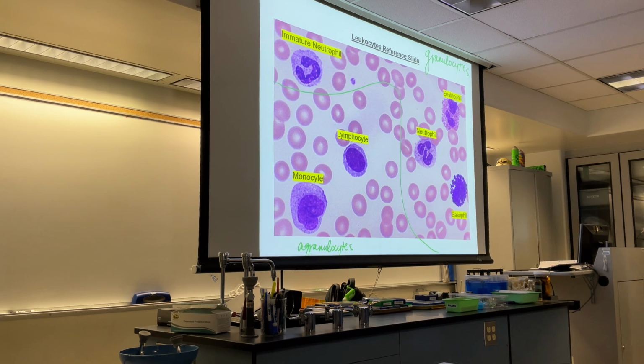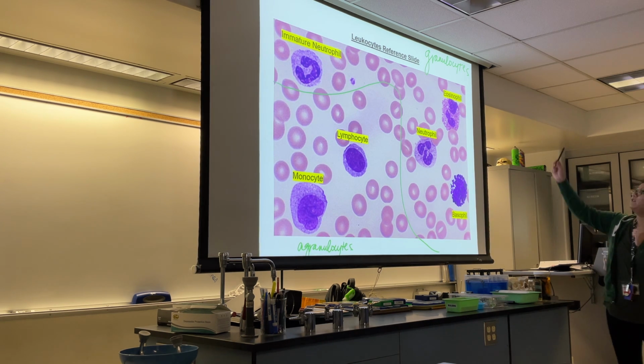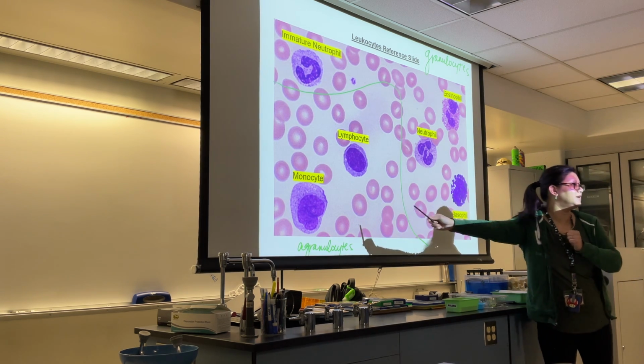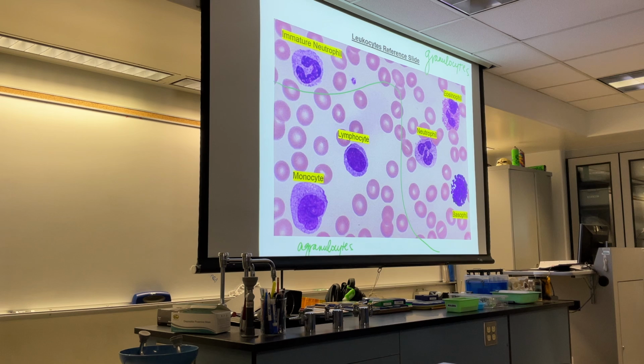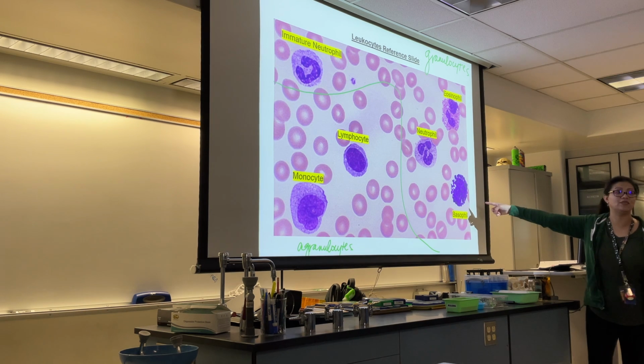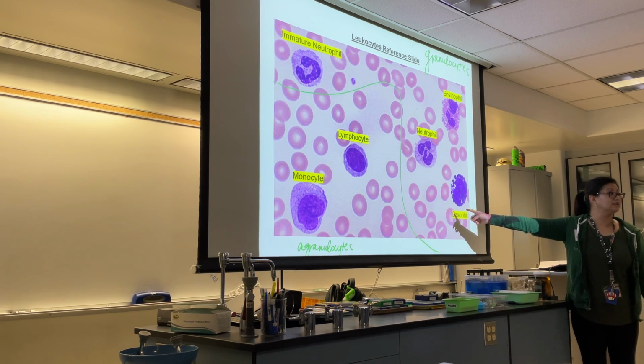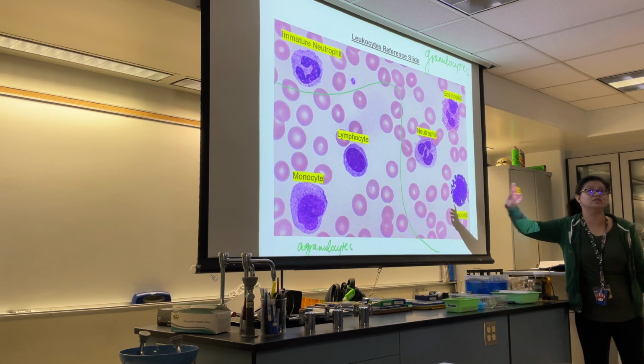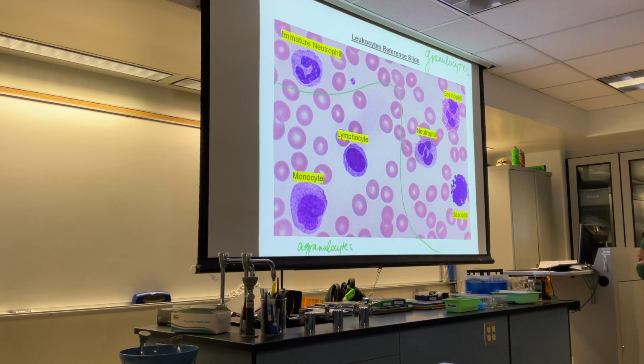But I want you to compare the appearance of the eosinophil and the basophil to the appearance of the lymphocyte and the monocyte cytoplasms. Do you guys see how for these 2 on the right, you can see a bunch of little dots everywhere, and it's actually most apparent in that basophil. Do you guys see that? Like all of those little black dots that you're seeing floating around, or purple, I guess, those are your granules. Everybody here clear on this?